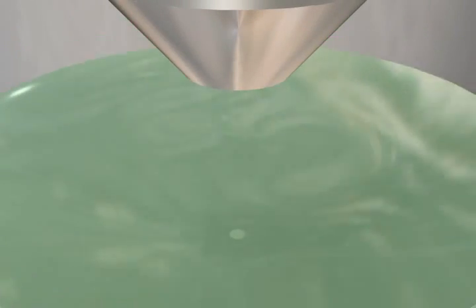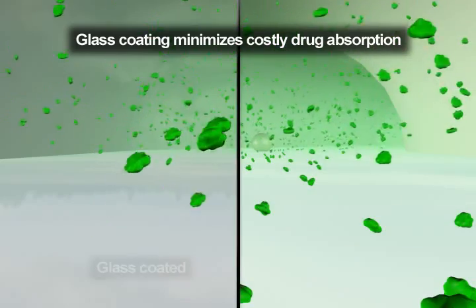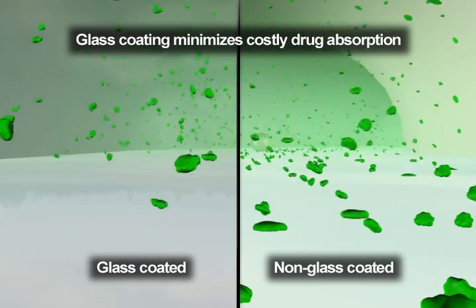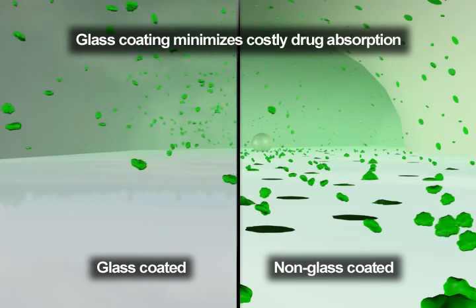A big advantage of the Q-Plate is the glass surface of the extracellular solution tunnels. Test compounds are less likely to stick to glass surfaces compared to plastic surfaces, and this leads to more accurate dose-response experimental results.